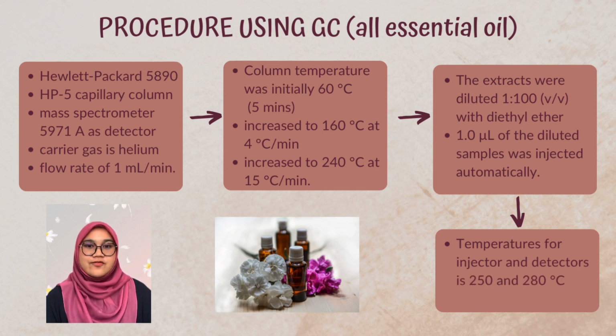The analysis of all essential oils was performed using a Hewlett-Packard 5890 gas chromatograph equipped with an HP5 capillary column, and a mass spectrometer 5971A as a detector. The carrier gas was helium at a flow rate of 1 ml per minute.